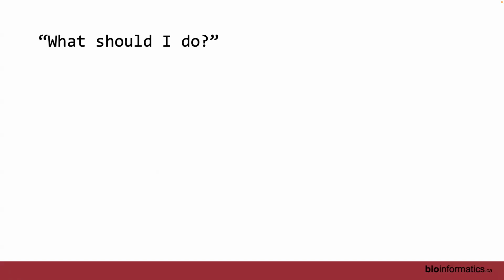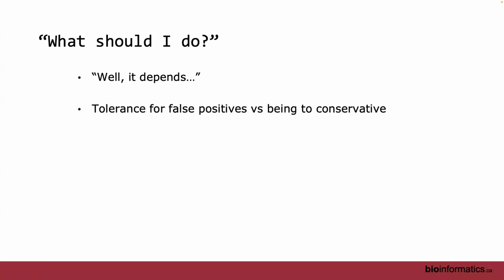So then the classic question is, you said to me, what should I do, right? And we say, well, it depends, the classic bioinformatics answer, right? It does come down a little bit to knowing whether the tool tends to be more sensitive or conservative. It comes down to your concern about how exploratory this is. Do I really only want to find things I'm really sure are different across the groups? Or maybe I'm just trying to come up with a list of possible biomarkers that I'm going to then do something further to filter down. That's where it kind of depends for you.